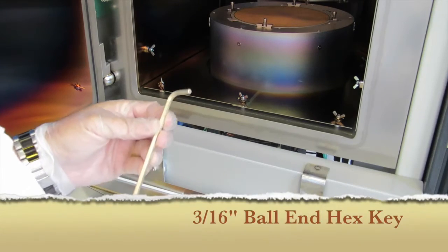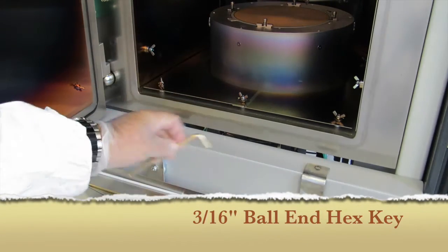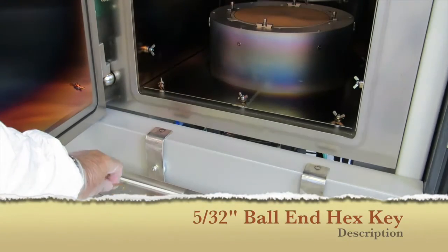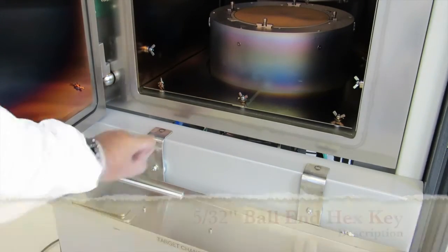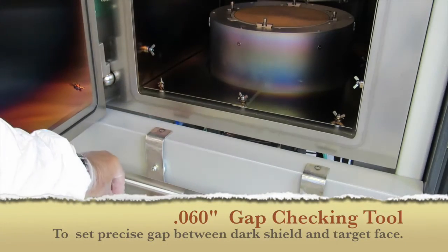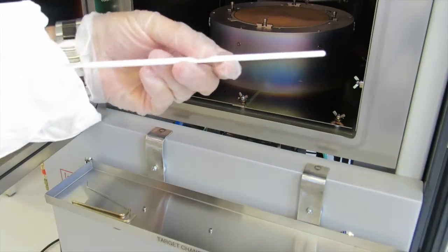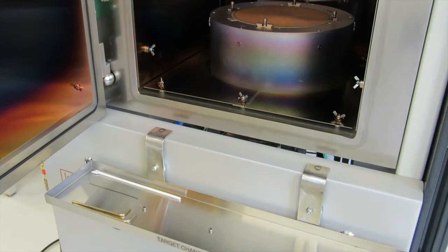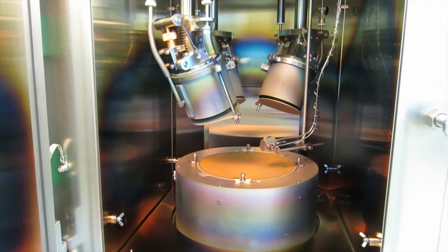This tray has all the tools you'll need for swapping targets. The first tool is a 3/16ths ball-end hex key. The second tool is a 5/32nd inch ball-end hex key. This tool is a spacer for setting the space between the dark shield and the target base. This white plastic tool helps in installing magnetic targets so they don't slam onto the face of the magnetron.